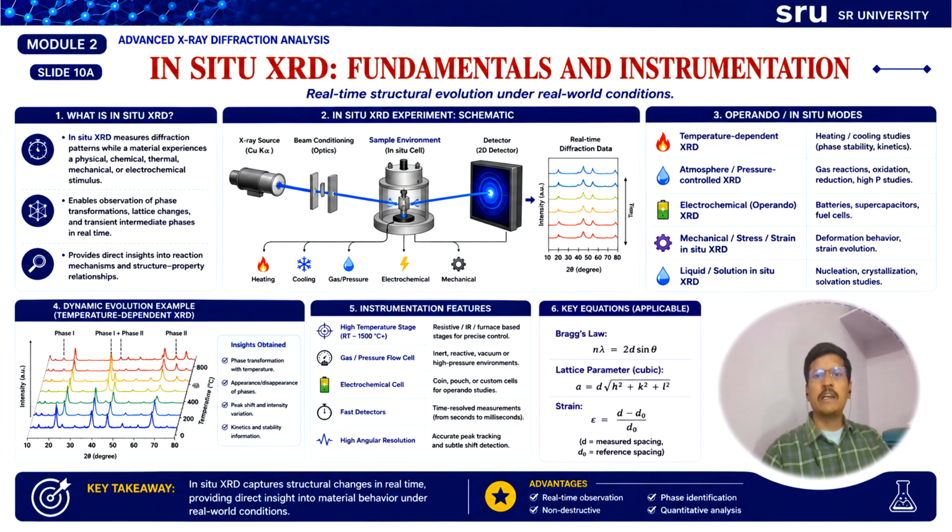And atmosphere controlled XRD investigates the reactions under different gases such as oxygen, hydrogen, or nitrogen. The electrochemical XRD is widely used for batteries and supercapacitors to monitor structural changes during charging and discharging cycles.